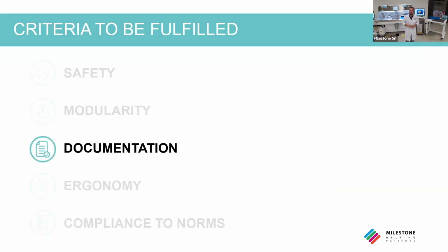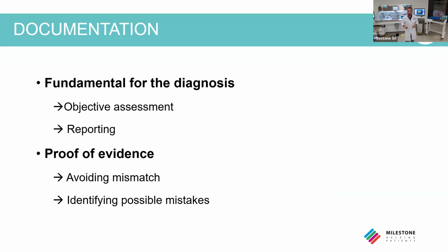Then, talking about documentation, we know that it is fundamental for the diagnosis. It should be an objective assessment, and this should lead to an enhanced report that is extremely important for the patient, because to assess the presence or the absence of a lesion or a tumor, there should be an objective assessment.